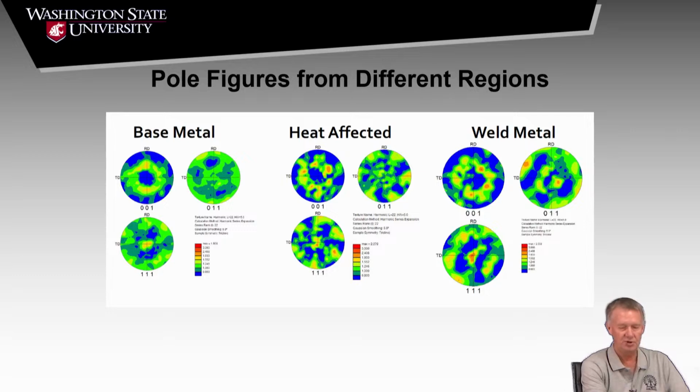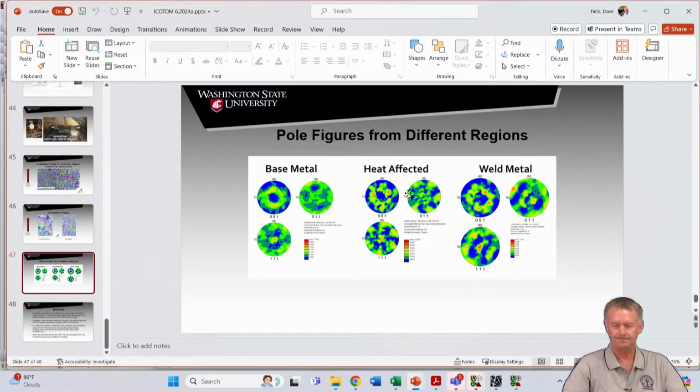We show pole figures a lot because they're historically familiar to people, so they're a lot more familiar than Euler space plots, and certainly a lot more familiar than Rodrigues space plots. Anybody else before we move on?